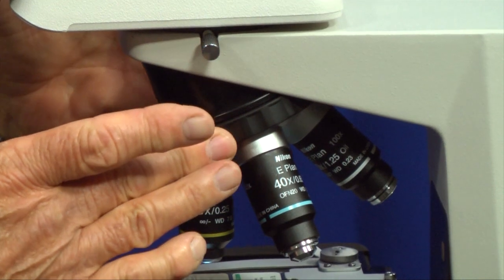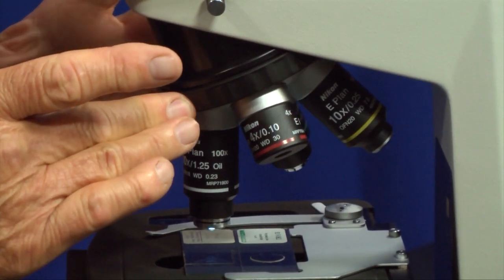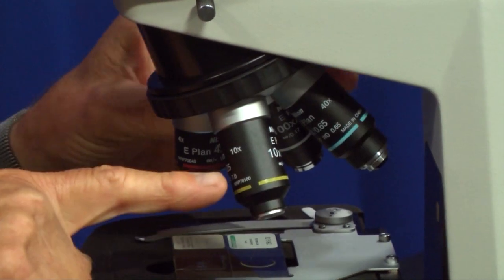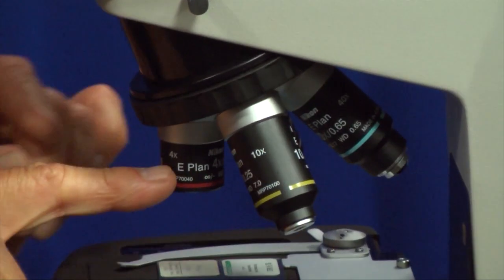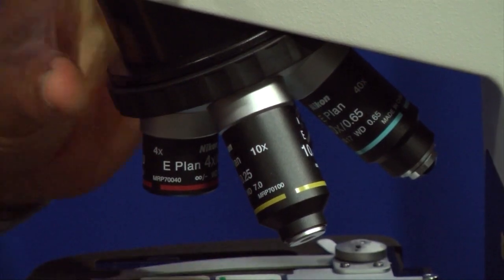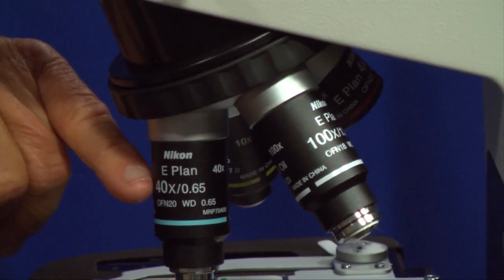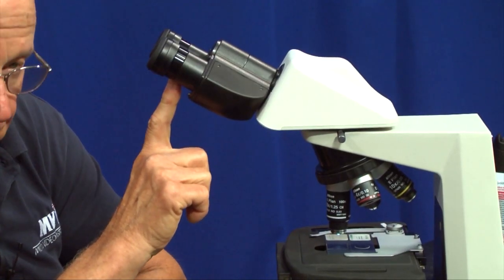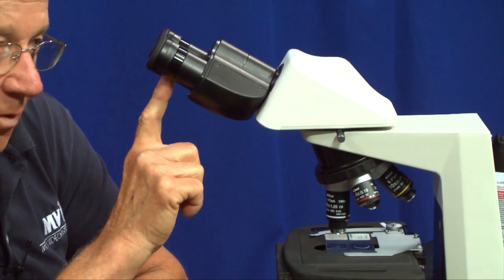We're going to talk about the nose piece of the microscope. This is the device that allows us to attach the microscope objectives to the microscope. This is the primary imaging lens of the microscope, called the objective. On this microscope, as on most biological microscopes you'd find in a university or hospital laboratory, the magnifications are the 4x objective, 10x objective, 40x objective, and 100x objective. That isn't the total magnification. The total magnification is the objective magnification times whatever eyepiece you're using. Most microscopes come with 10x wide field eyepieces.